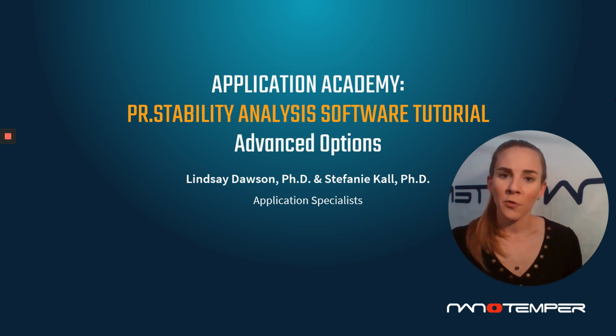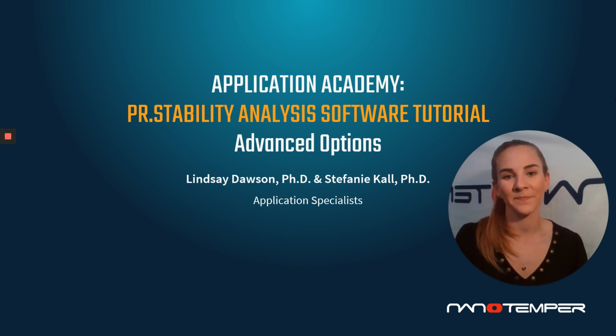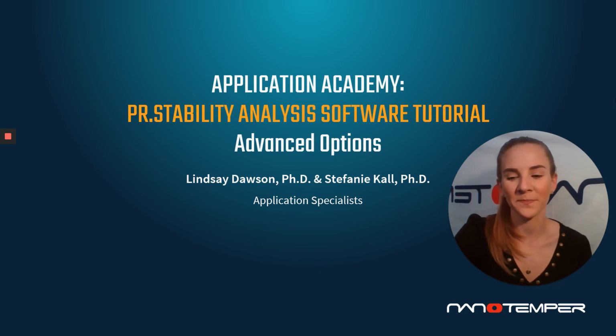To start out, we're going to walk you through how you can go about customizing the view of your data table, as well as some of those analysis settings. And again, showing you how this is really meant to standardize your analysis workflow, as well as help you to reach stronger and faster conclusions about the stability of your data. Let's jump into the software.